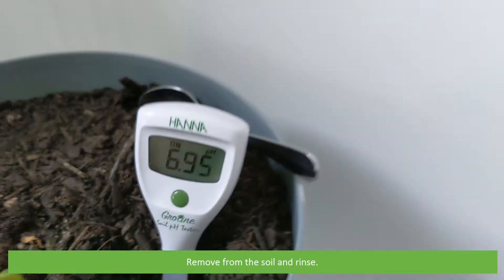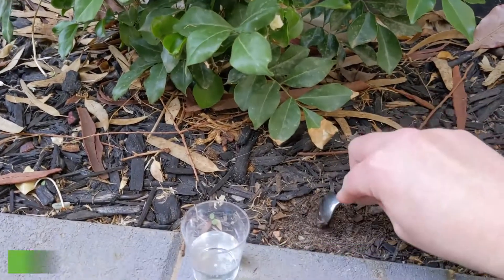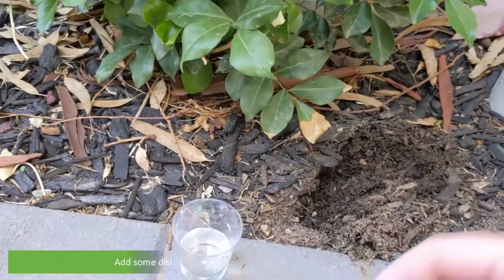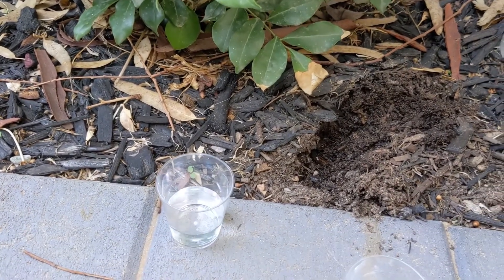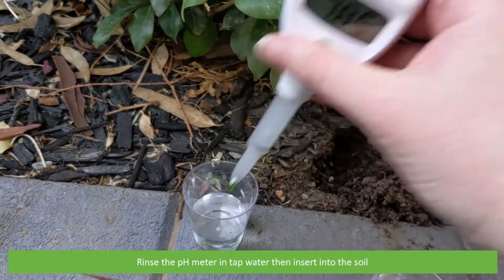The small hourglass has disappeared and we have our soil pH reading of 6.95. Remove from the soil and rinse. Repeat the same steps to take further measurements: dig a hole to loosen the soil, then add some distilled water so that the soil is damp but not saturated.